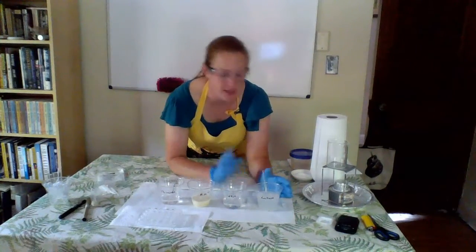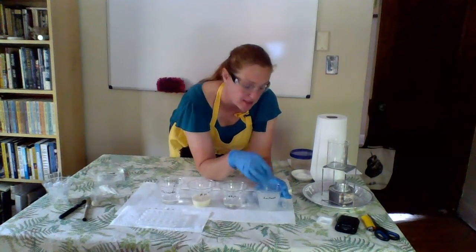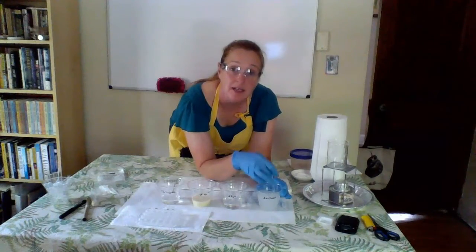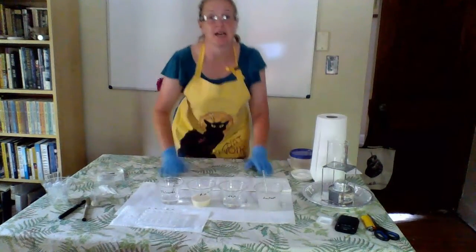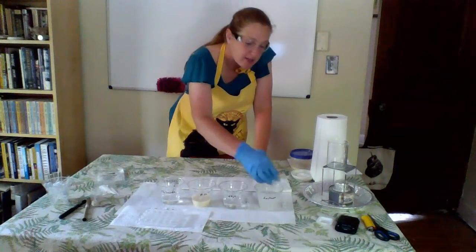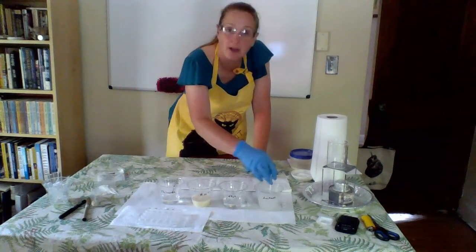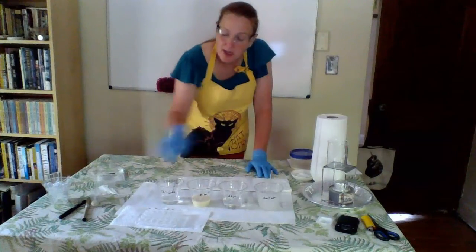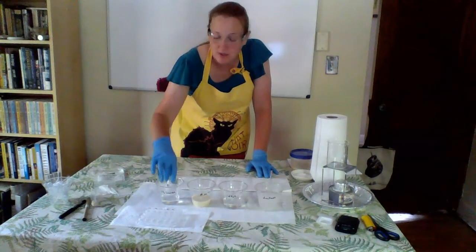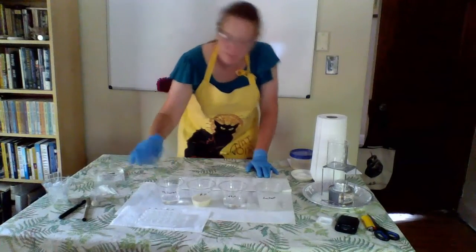Familiar with how lactase works. Now, one of the things I noticed when I was making up my lactase solution and crushing my pill is that the pill really didn't crush as nicely as I would have liked. So I went ahead and dropped it in, and then I've just been vigorously mixing this to try and get a really homogeneous solution. And the same thing with my 5% sucrose solution, I want to make sure to get this really, really mixed up.